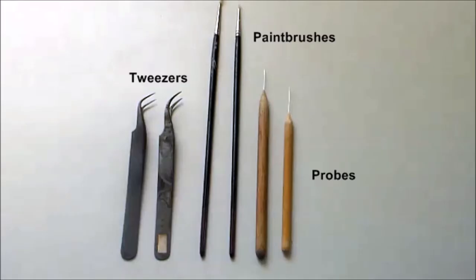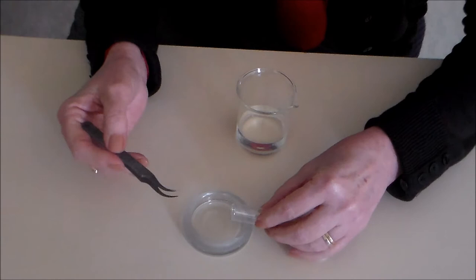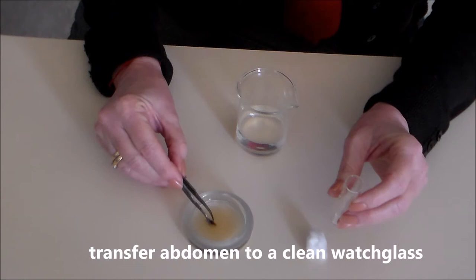Basic tools are needed for the dissection, namely curved tweezers, small soft hair paint brushes, and 2 needle probes. You will also need a 10% potassium hydroxide solution to soften the abdomen and remove non-sclerotized material, distilled water, acetic acid, and glycerin. Once the abdomen is softened, transfer it to a clean watch glass and add distilled water and a drop of acetic acid.